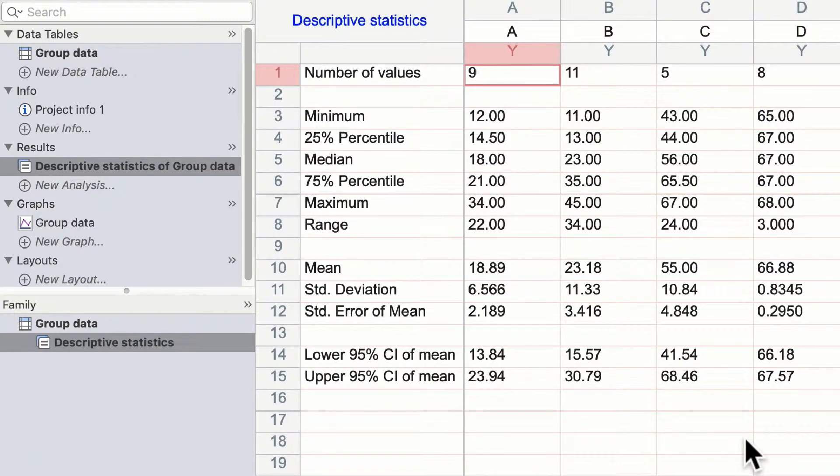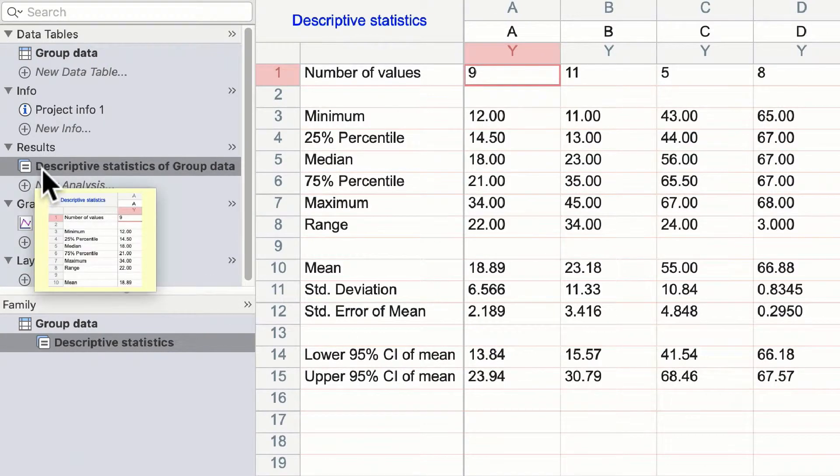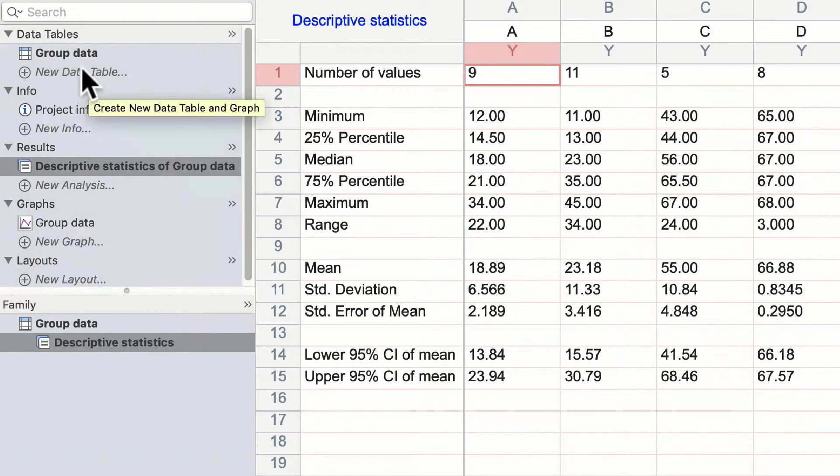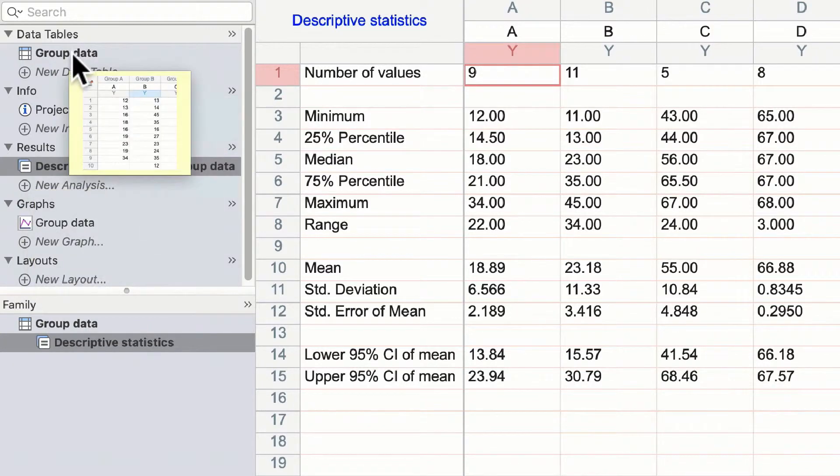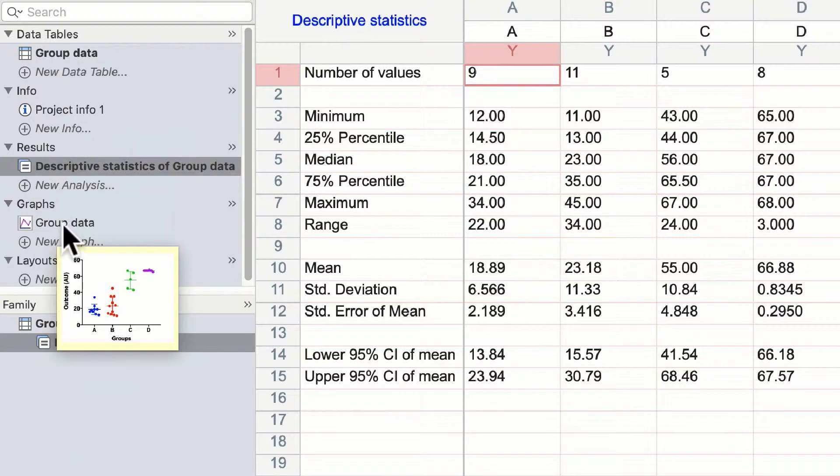On the left-hand side, you'll see we now have a new results pane called descriptive statistics of group data, group data being the name of the table and the graph that I'm analyzing.